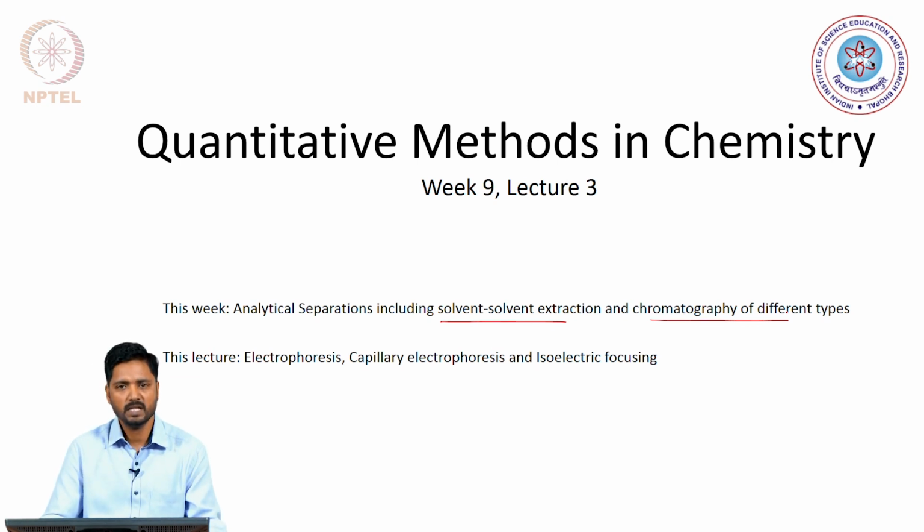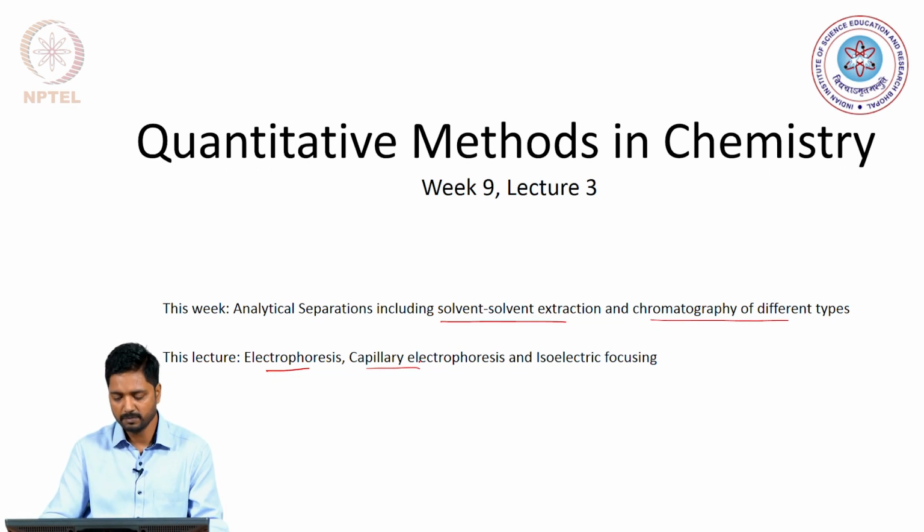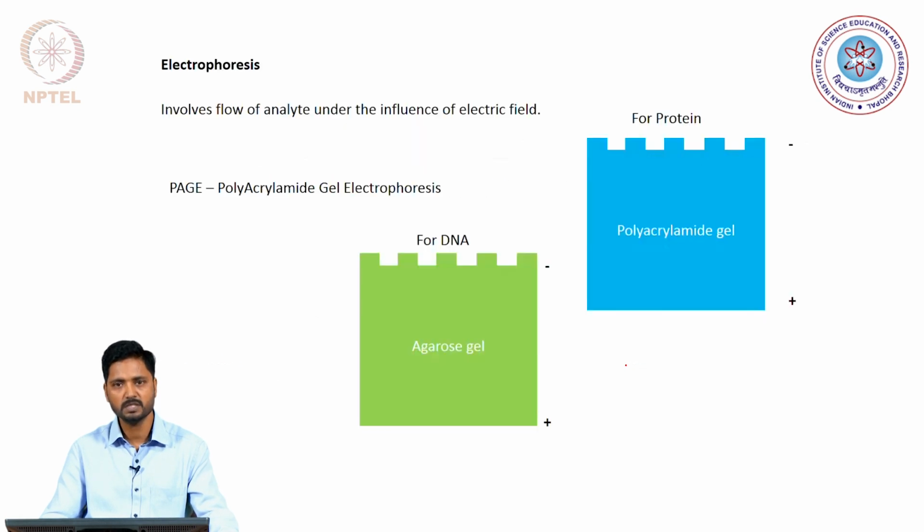Now, this lecture is specifically focused on techniques that are more utilized in a biological context for achieving separations. So, we will be talking about electrophoresis and its capillary version, and also we will be discussing isoelectric focusing in the current lecture. So, let us get started with the concept of electrophoresis.